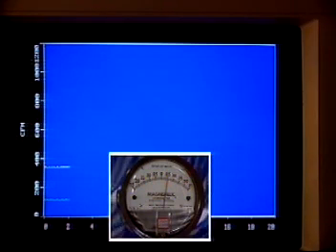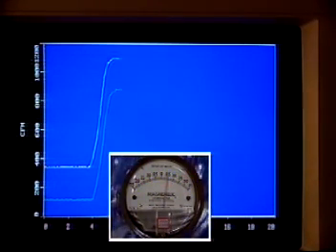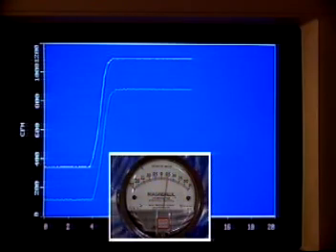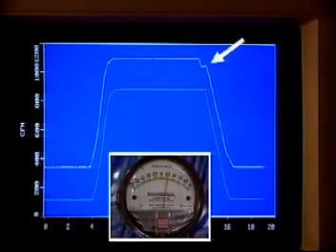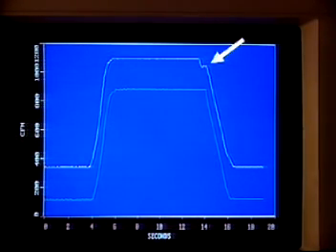This is a graphical representation of a sash opening and closing when a general exhaust is used in the room. The white line is the room's total exhaust, and the green line is the total supply into the room. The small increase in the total room exhaust when the sash is closed represents the point where the general exhaust valve opens. This valve helps to ensure that the room pressure will stay negative.